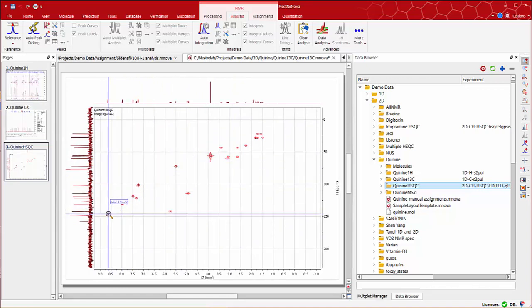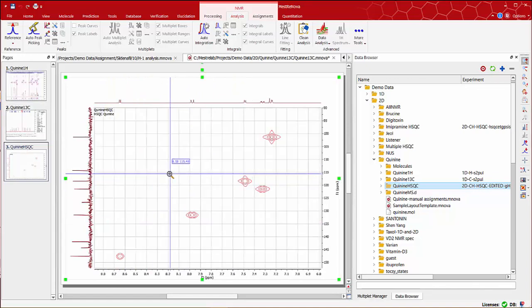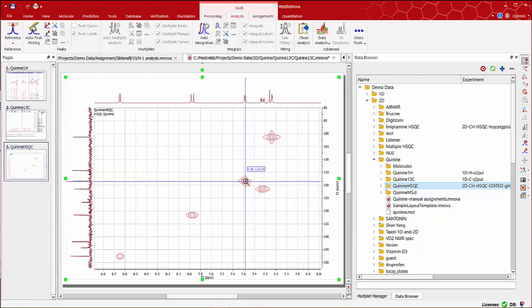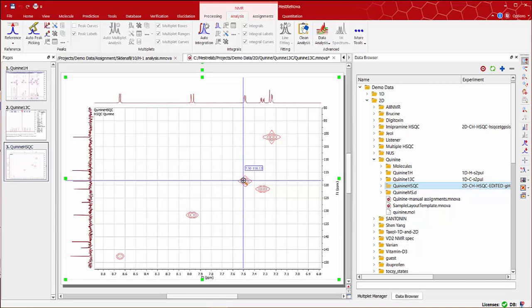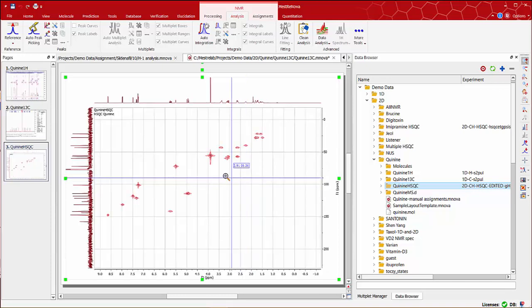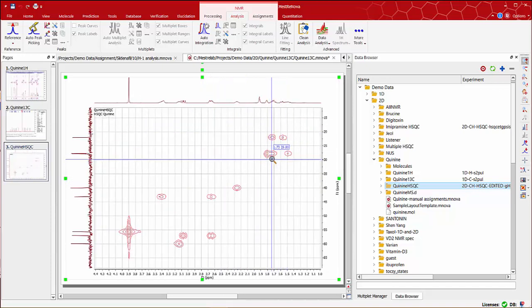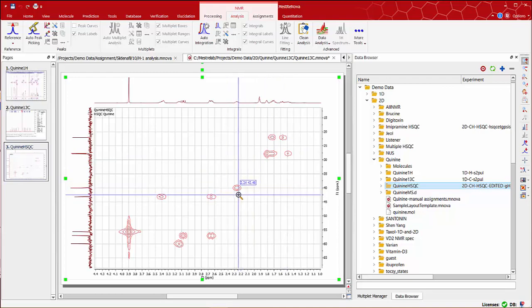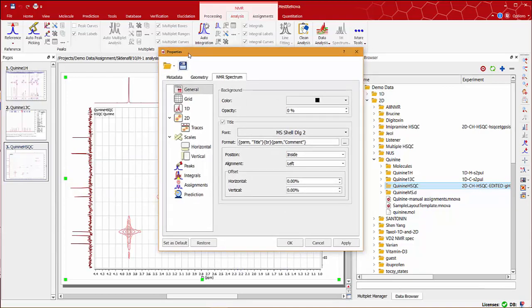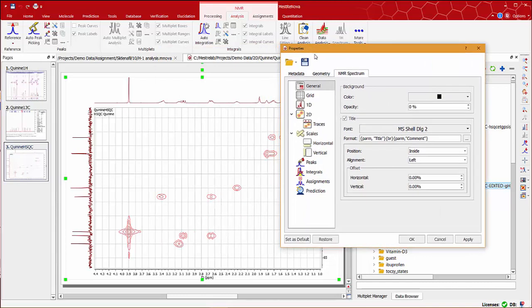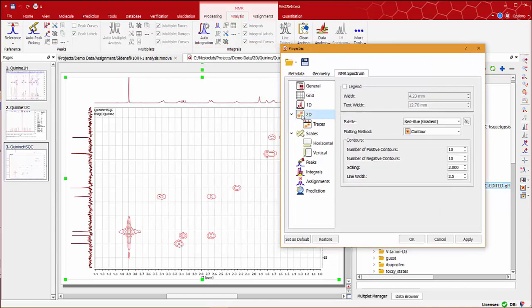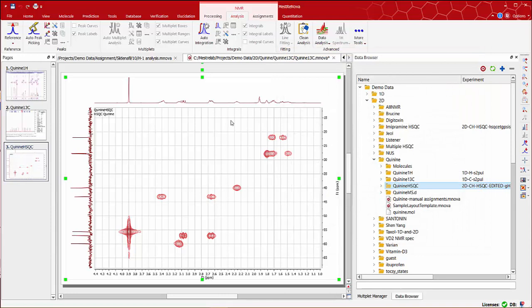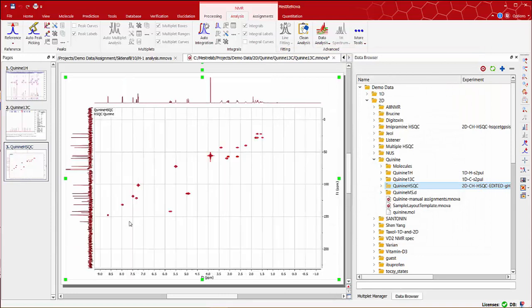Zooming in on any area we can easily see good alignment between 1D and 2D peaks. We may wish to improve the contours display. Just double click anywhere on the spectrum to bring up the properties window, and then select 2D to change, for instance, the scaling to a smaller number, or increase the number of positive contours. Apply the changes and zoom in on the region that we are interested in.